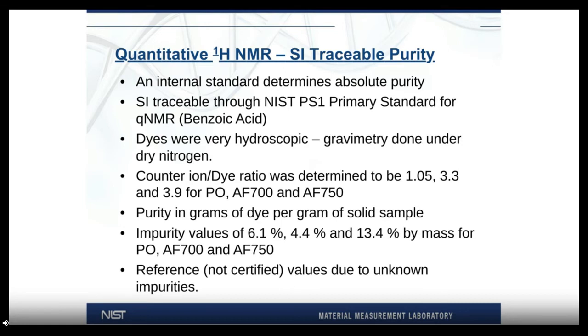But since we don't know what is causing this discrepancy, what are the unknowns that we haven't identified, the purity values become reference values instead of certified values, certified value being a higher level of confidence according to NIST criteria.